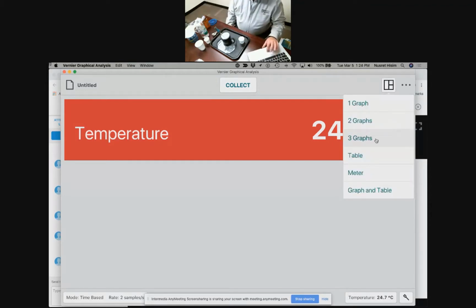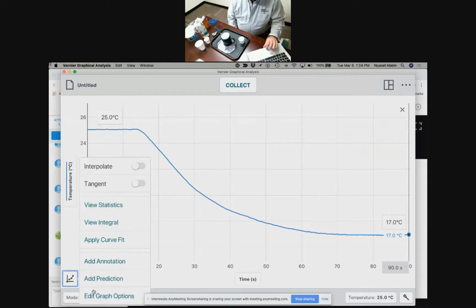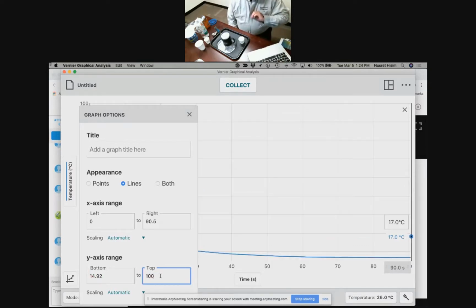Jess is telling me that the majority says that the temperature is going to go up. Now you will notice that I auto-scaled this, and the highest temperature up here is 26 degrees. And if we're saying the temperature is going to go up, I need a little more space. So I'm going to change the axis on the graph so that the highest value is higher than 26 degrees. So my y-axis, instead of 27 degrees, I'll make this 100. Be optimistic here. That would be kind of exciting if it went that high, but we'll see.